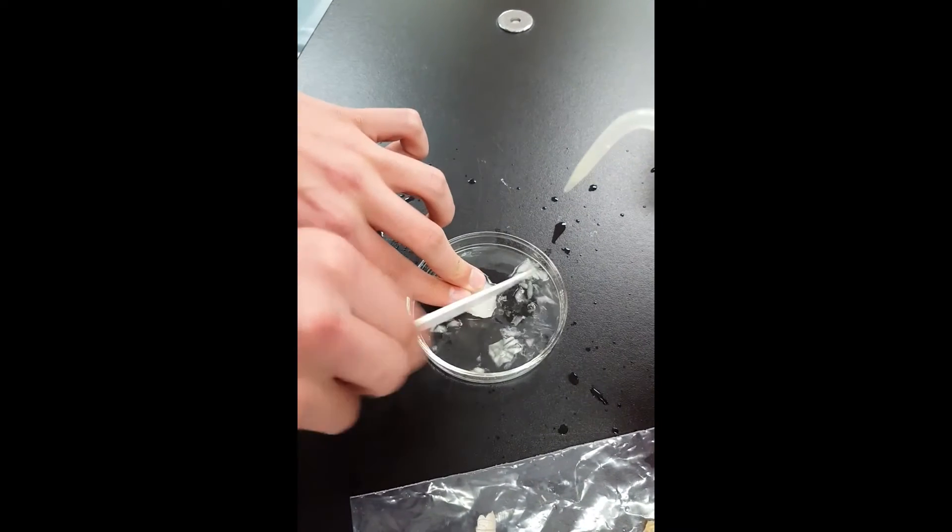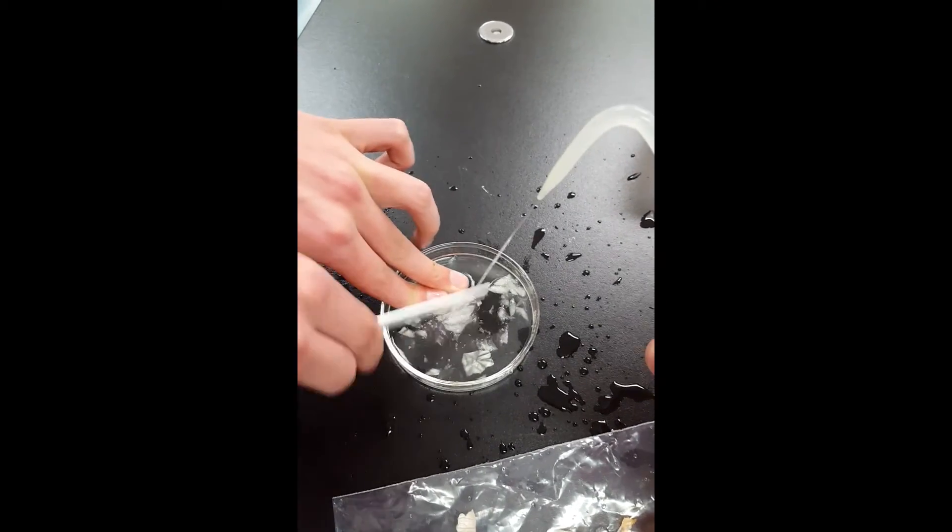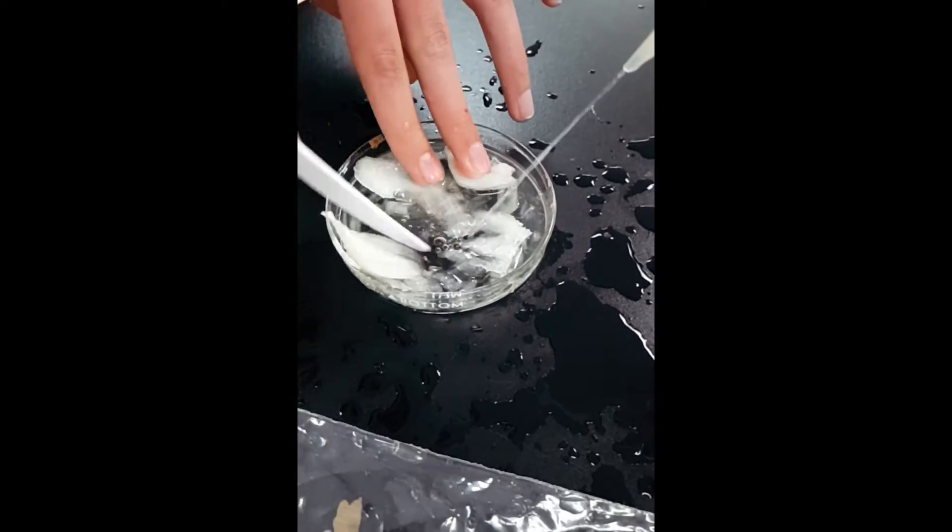The first step involved in this lab is to carefully cut up the onion in a solution of distilled water until it reaches a consistency of applesauce.